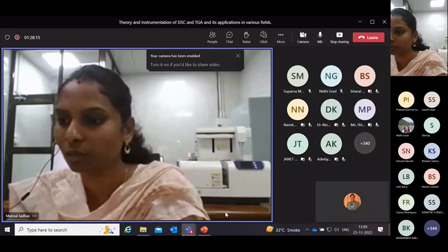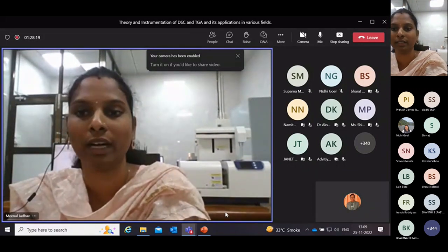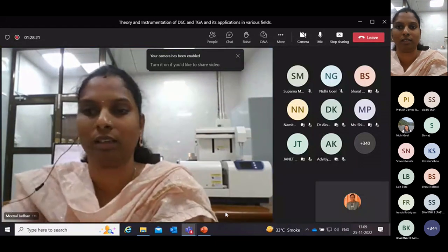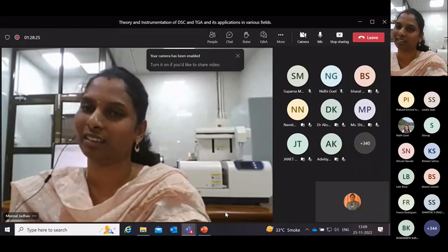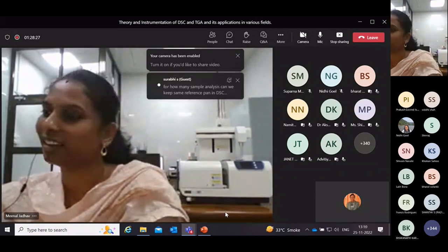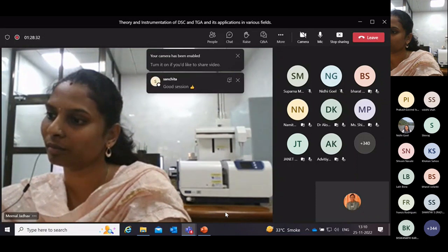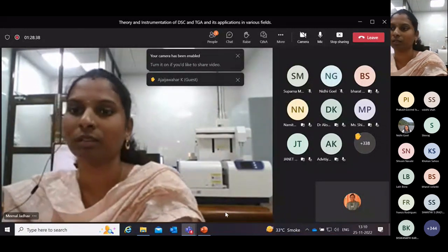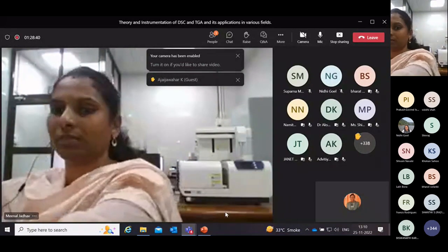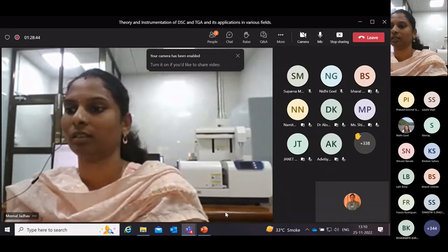How to identify the melting peak corresponding to an additive added? You simply run it in DSC and you will get the melting of the additive. There is no special technique required. You put the sample in the aluminum crucible, crimp it, and put it in a DSC. If the melting of the additive is below room temperature, you start from -70 or -170 and see at what temperature melting is occurring. Melting is an endothermic reaction, so you will see the peak due to the melting endotherm.